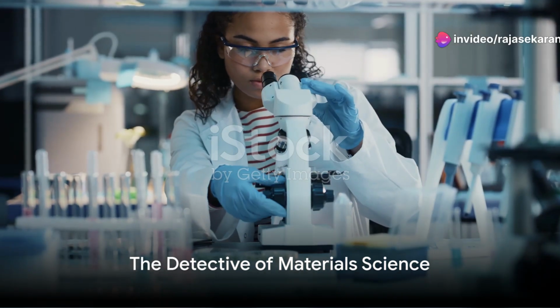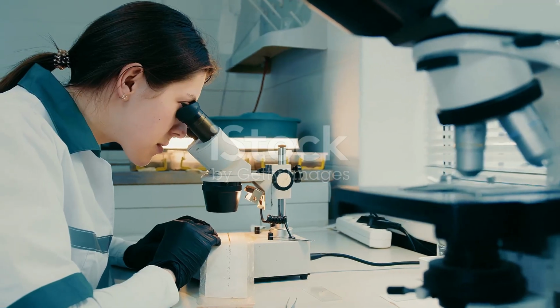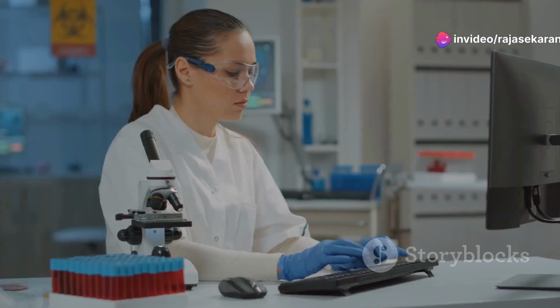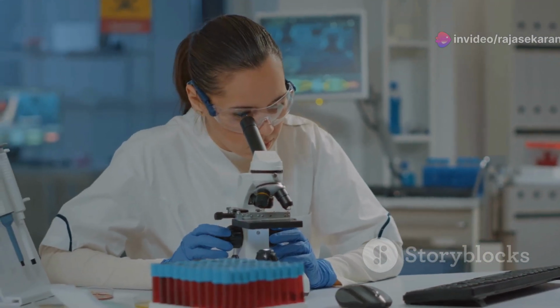Imagine a detective meticulously scanning a crime scene for clues. In the realm of material science, EDS is that detective. It's a method used to analyze the elemental composition or chemical characterization of a sample. It's a vital tool in the toolkit of any materials scientist or forensic investigator.